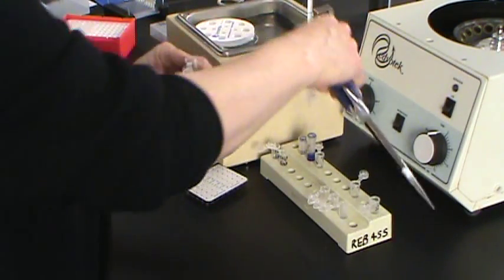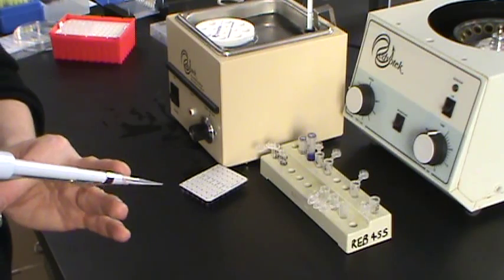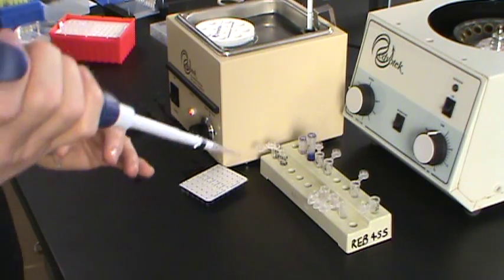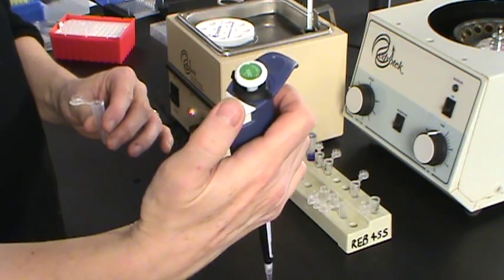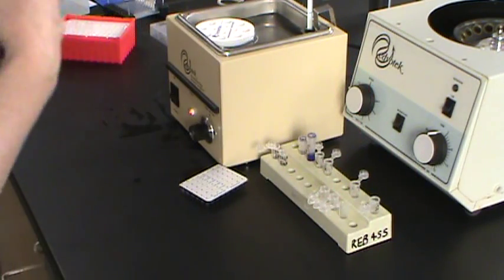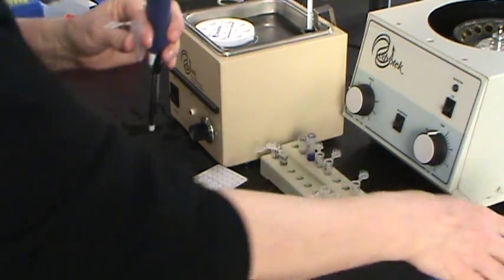And remember, I didn't at this point because I'm saving on tips and this is for demonstration, but anytime you're putting these tips into a new reagent, you should change the tips that you're using. We will have waste containers for the tips. On this particular pipetter, this white button ejects the tips. On the Edvotek pipetters, it is the blue button that's right here.